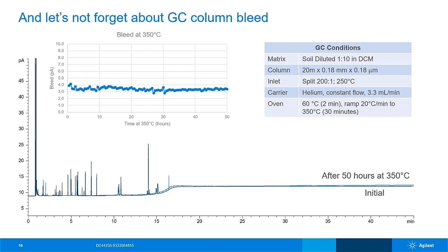What happens is that in some cases your bleed may go up, may go down, it may affect your retention time, and if your bleed goes up or down, that increases your relative standard deviation error. And that means that even though you are able to quantify your analyte, your standard deviation will be all over the place. So it's important to have that consistency over time for inertness and also for bleed.